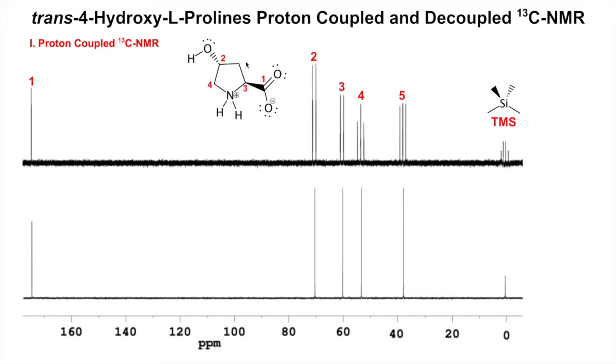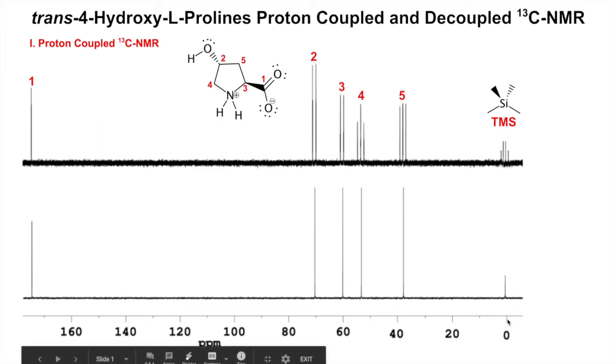Yep. And then, well, these are methynes, to review the organic talk. And then here, another methylene. Okay, and that's it, the 5th one. And then the TMS is for, the 4 carbons of TMS are showing up there. We set that to 0.